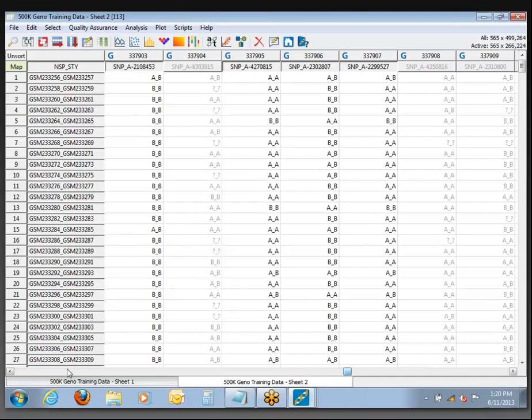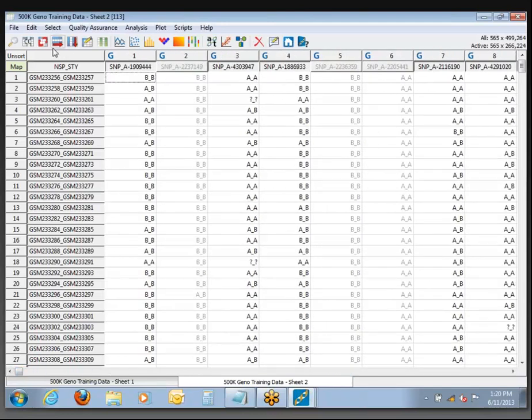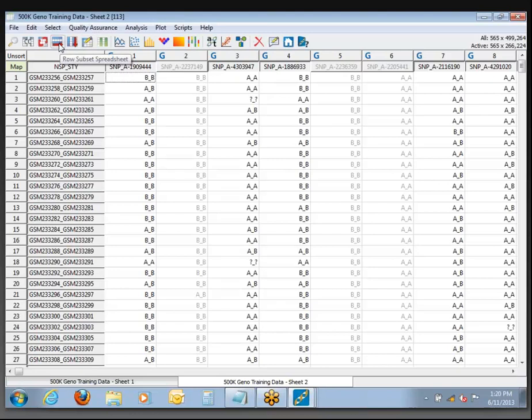When we look back at the genotype spreadsheet, we see 266,000 columns remain active. This will be the first time we've used the Subset button. Up here at the top left, you see these two buttons: the red arrow pointing to the right is called Row Subset — think of it as taking active rows and pulling them out to create a new sheet consisting only of those. The red arrow pointing down is the Column Subset — it takes the active columns, in this case 266,000 of them, and pulls them down to create a new sheet where only those are visible.